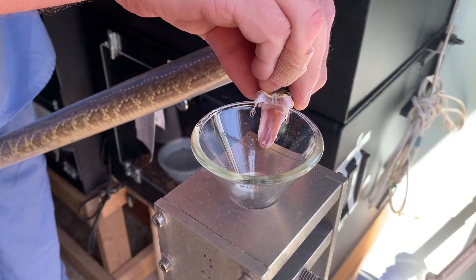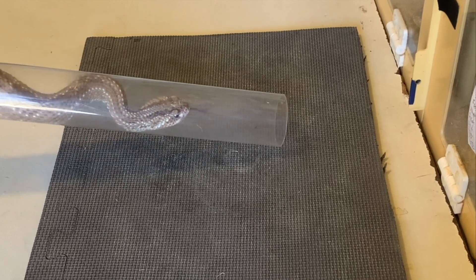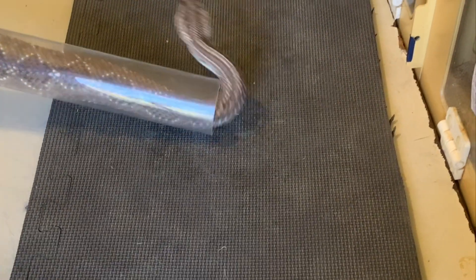You may notice this snake has very white venom, indicative of a high neurotoxin content. Here's another view of how the snake comes out the far end of the tube — just a little bit closer so you can see it a little bit better.